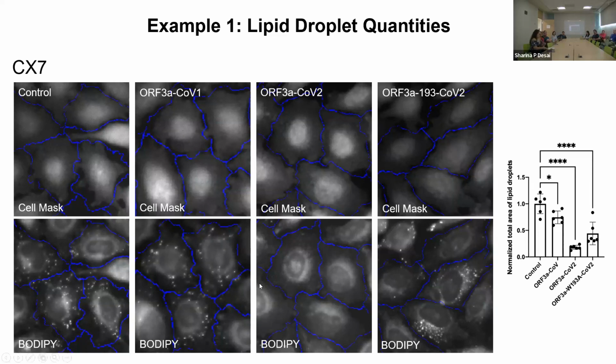And here in this experiment, we show different amounts of cellular lipid droplet. The software can do the quantification for you, and the bar will show here. But please note that each dot is not only one cell, now it's one well, because we quantify at the well level. And in each well, you can quantify thousands of cells.